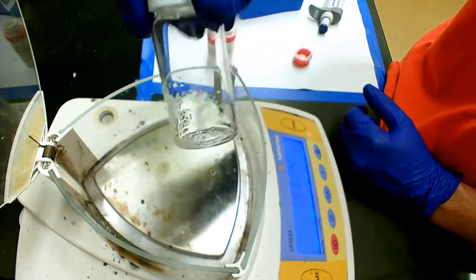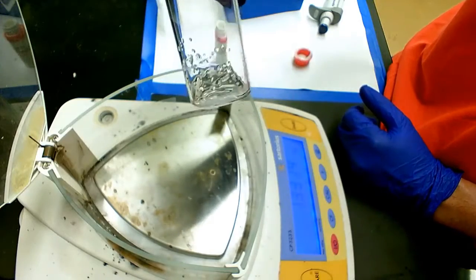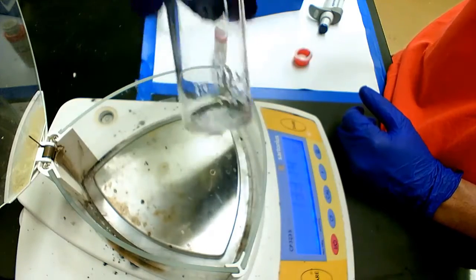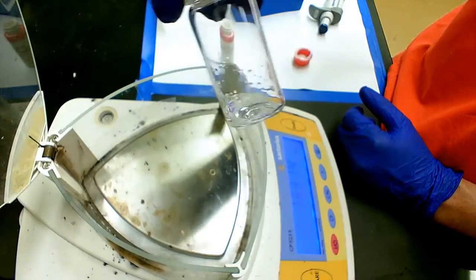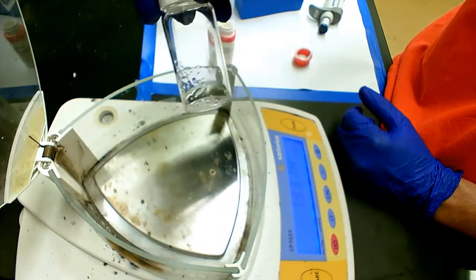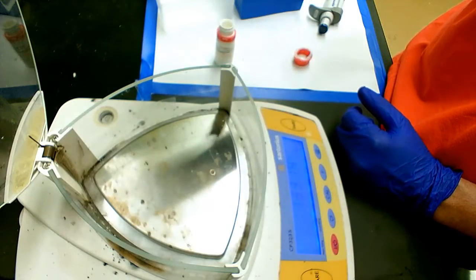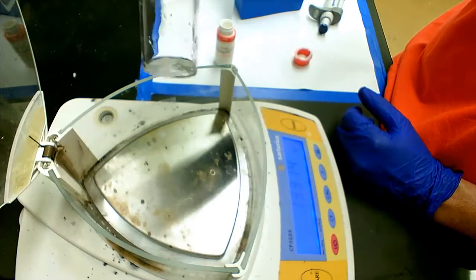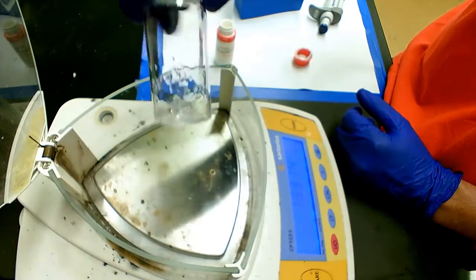We have a couple of ways to dissolve the polymer. One way is to just let it sit. You can also put a stirring bar into this and stir it well, and even heat it up a little bit. All of this can be used to prepare a uniform polymer solution, which is super important before you move on to make your polymer thin film. I'm going to skip this step now. I just wanted to show you how to make a polymer stock solution, so that you can use it later to make your polymer thin film.